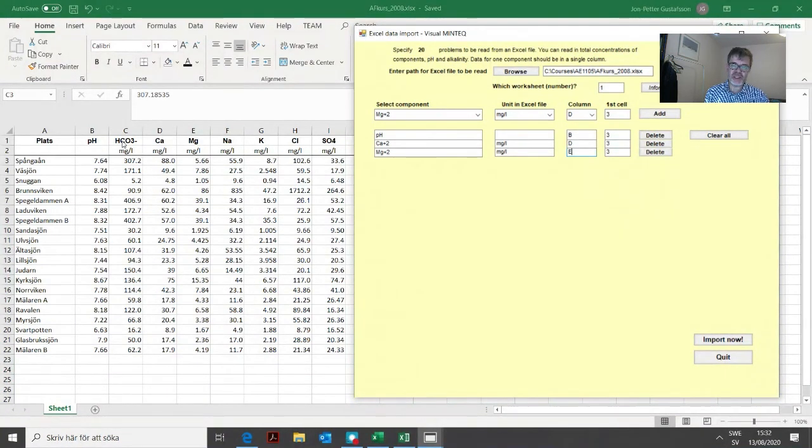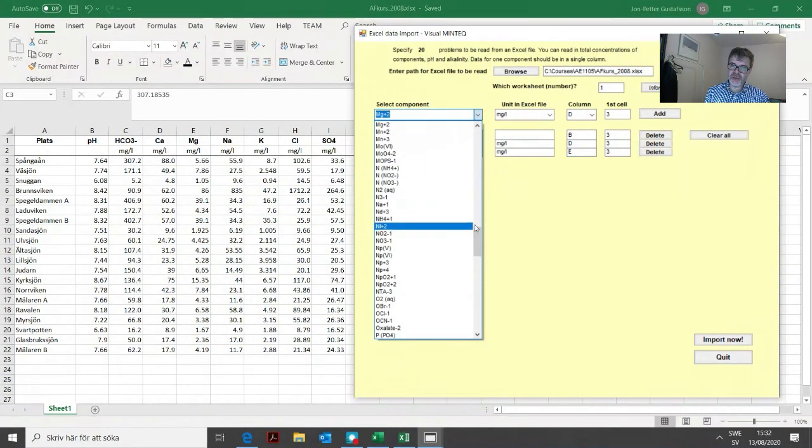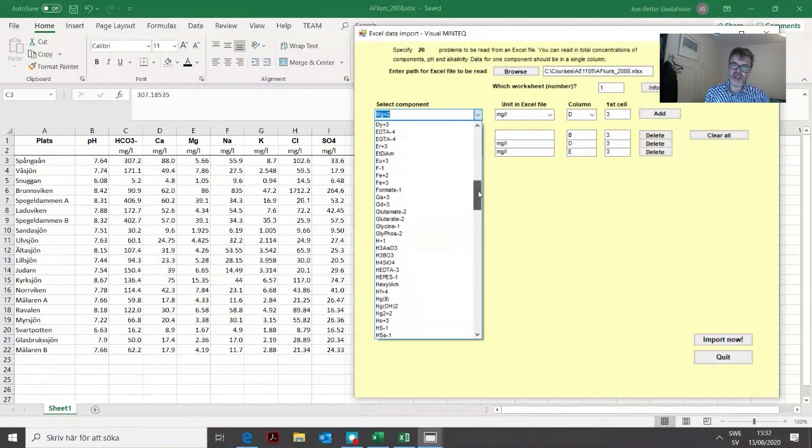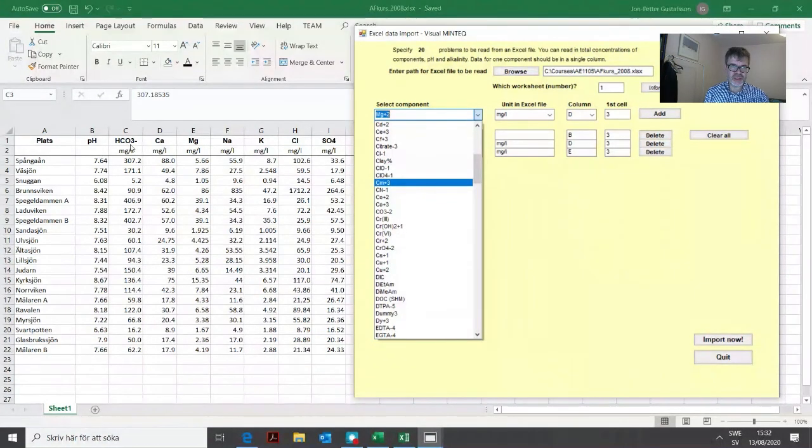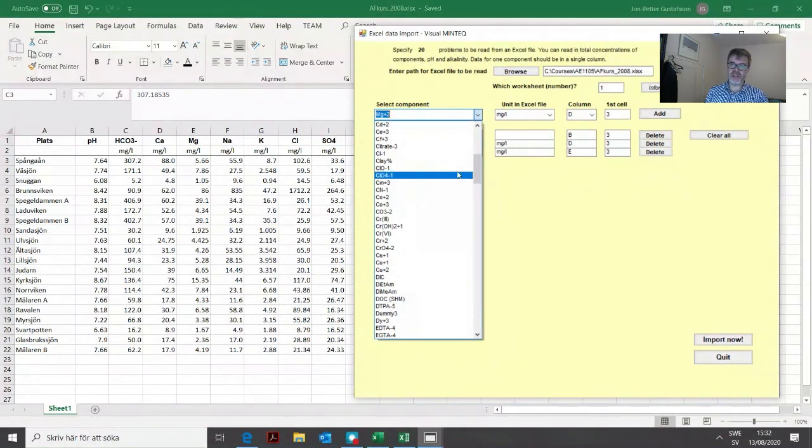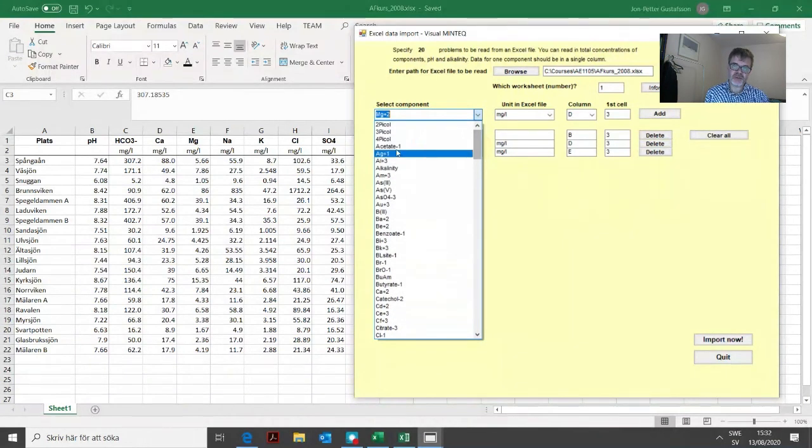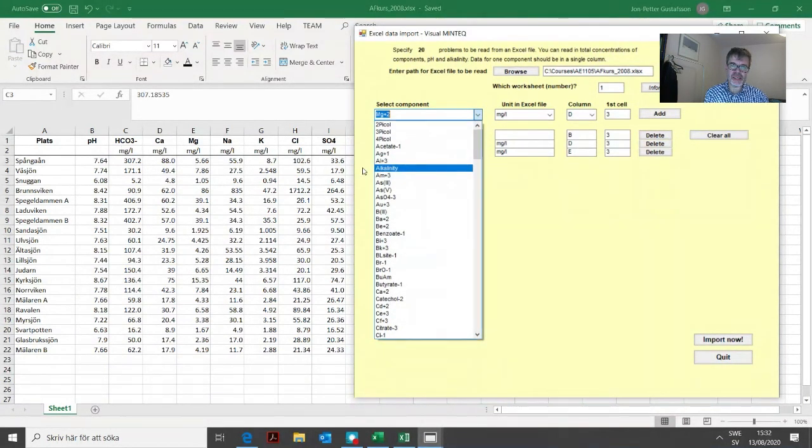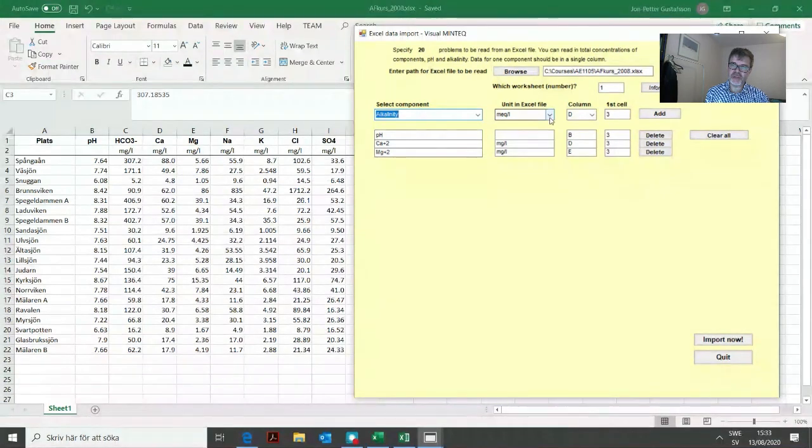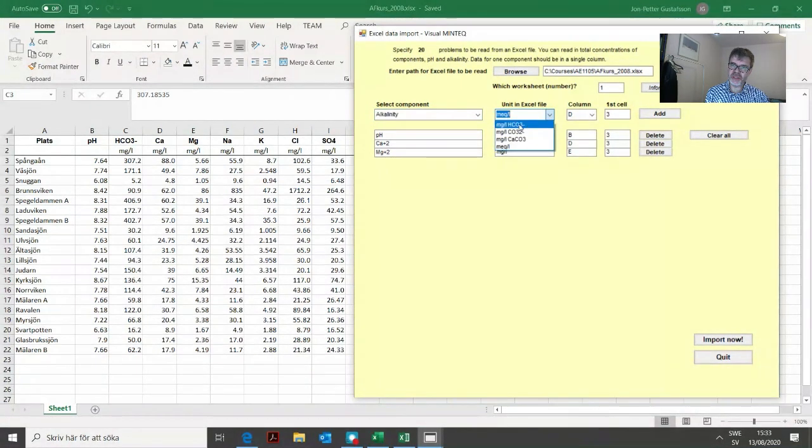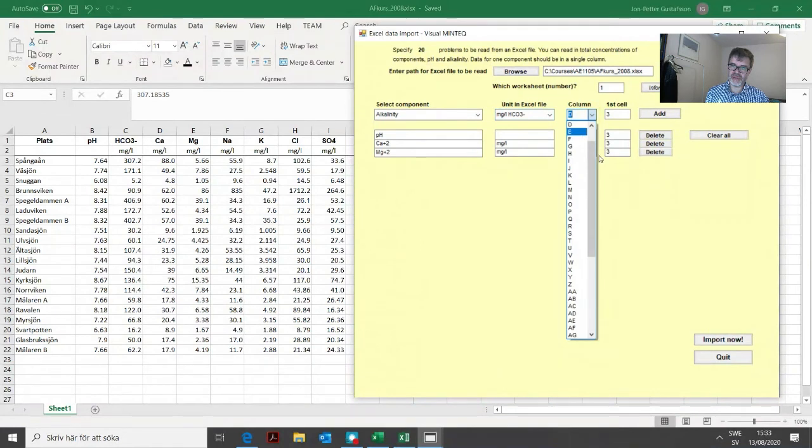Then we need to add bicarbonate. We don't have any bicarbonate here, we just have carbonate, but usually when we have bicarbonate defined, it means we've actually determined alkalinity. So we find alkalinity, choose the right unit which is milligrams per liter of bicarbonate, and then we have column C3.